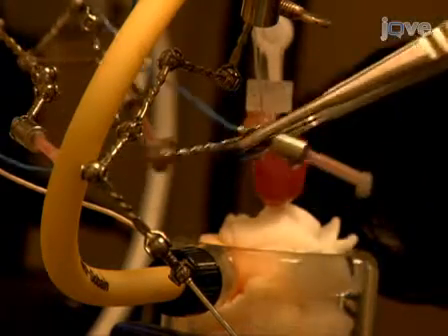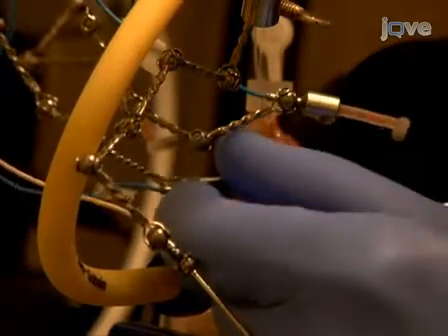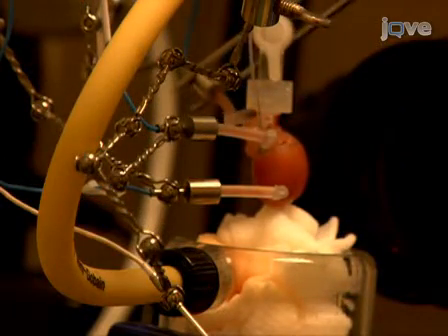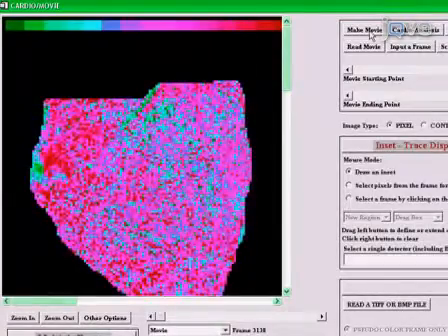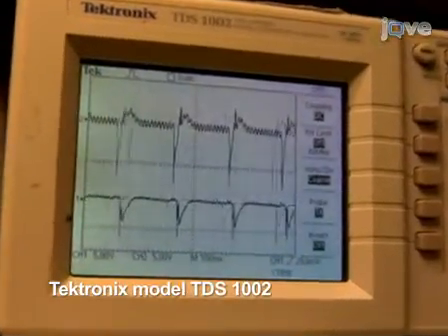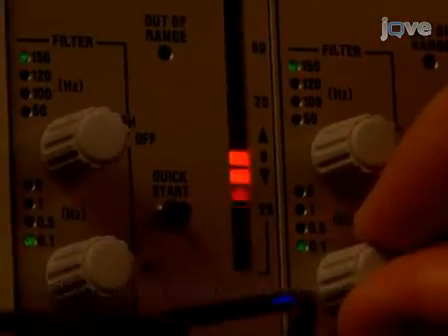During the loading procedure, gently place three ECG leads on the surface of the heart that is not facing the optics used for mapping. The first electrode is positioned on the posterior apical portion of the left ventricle, the second is placed on the left atrium, and the third acts as a reference electrode on the aortic root. The atrial and ventricular electrographic signals are subsequently amplified, digitized, and displayed alongside optical signals using the software. An oscilloscope is also used to visualize the surface ECGs in real-time and to assure adequate pacing. Set the ECG amplifier at 0.1 Hz for the high-pass filter and 150 Hz for the low-pass filter.